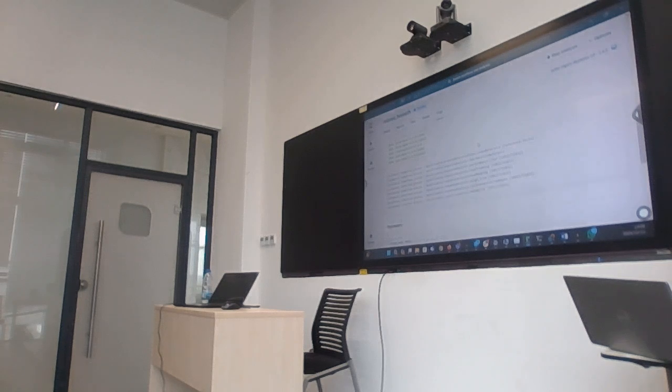Then what's the error here? Okay, I've got it. I think I know what the problem is. I don't know how to fix it, but I do know what the problem is. Your username has spaces in it. A lot of these tools do not like names with spaces. We need to fix the workflow to deal with it better, but for now, we're making a new user.